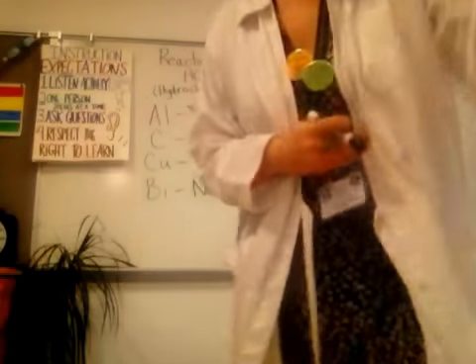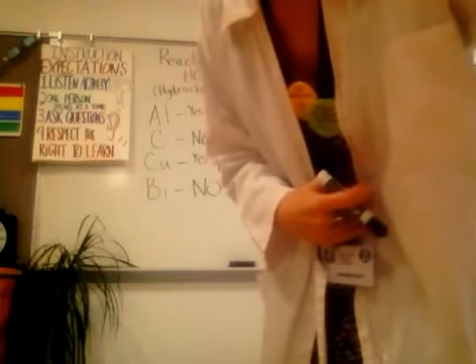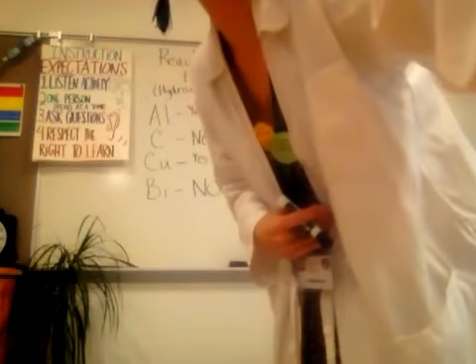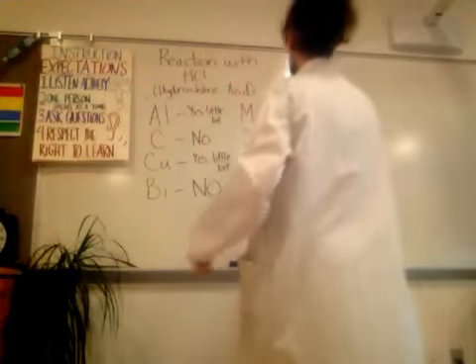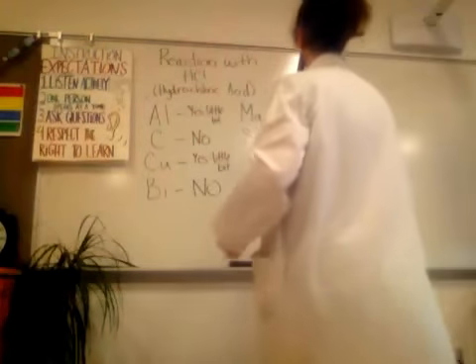We've already determined that magnesium is a yes, but just to give you a heads up of what it looks like at this point, there are still some bubbles forming there. And here we have silicone. Silicone, no bubbles, no color change, nothing happening there. So silicone is going to be a no. Then we've got the sulfur. The sulfur, it did not. So notice that it's just hanging out on the top, on the surface of that hydrochloric acid. So that is also a no.